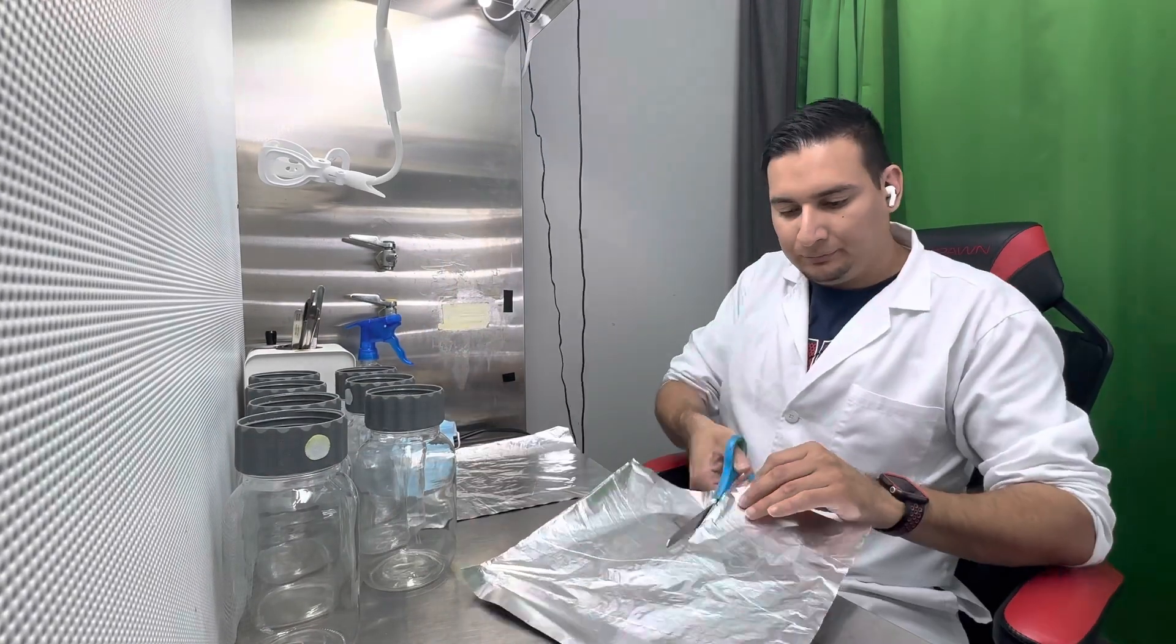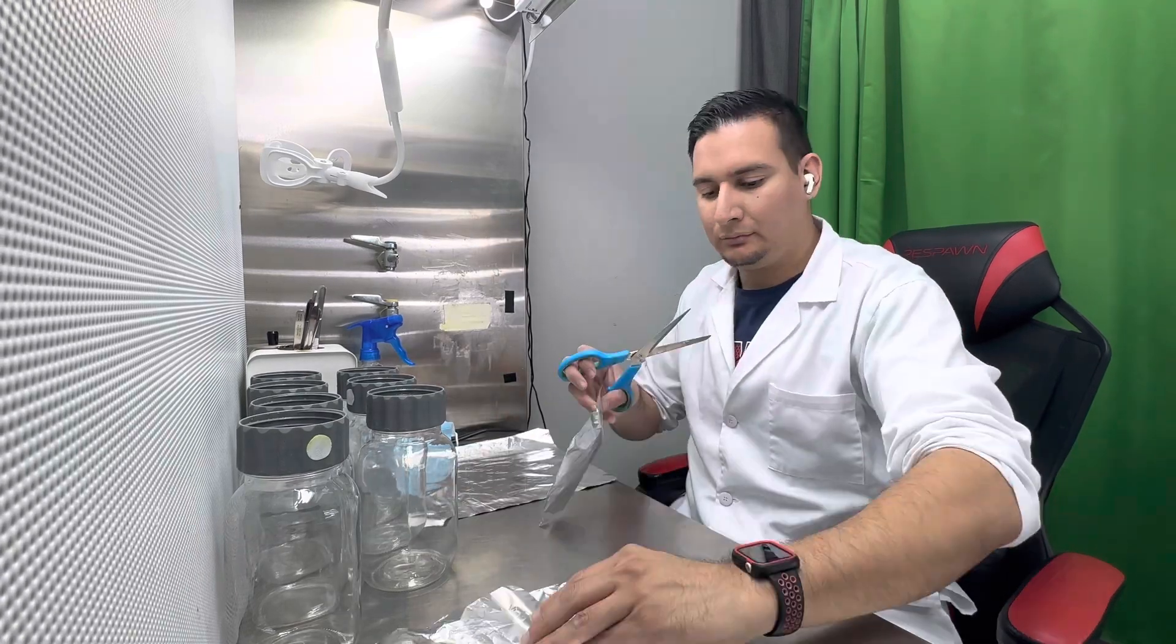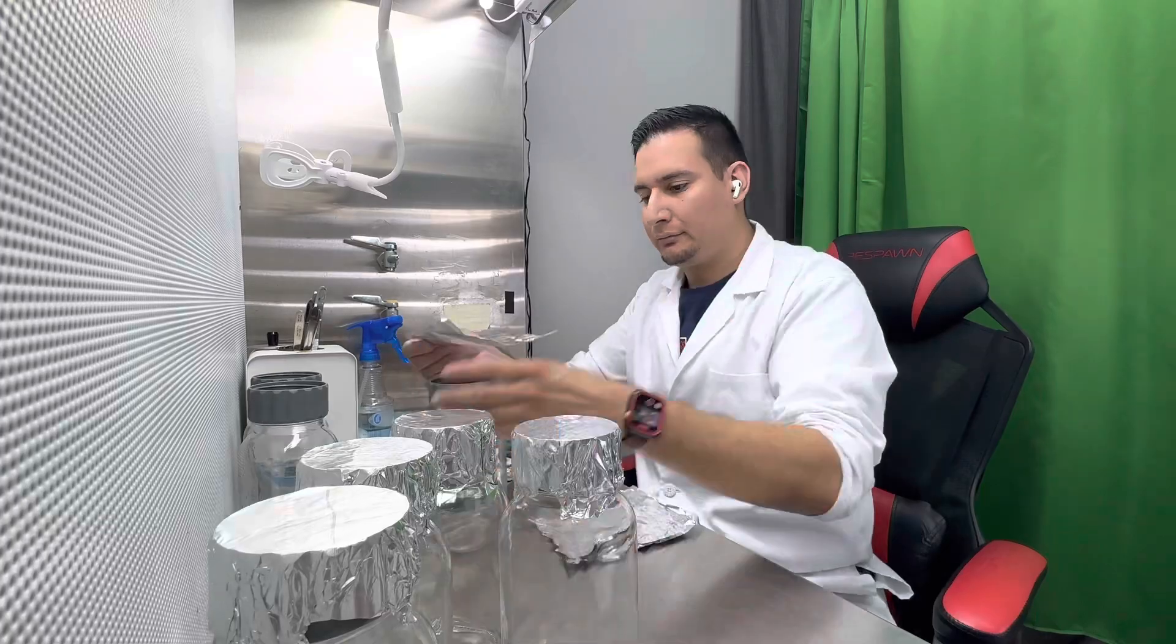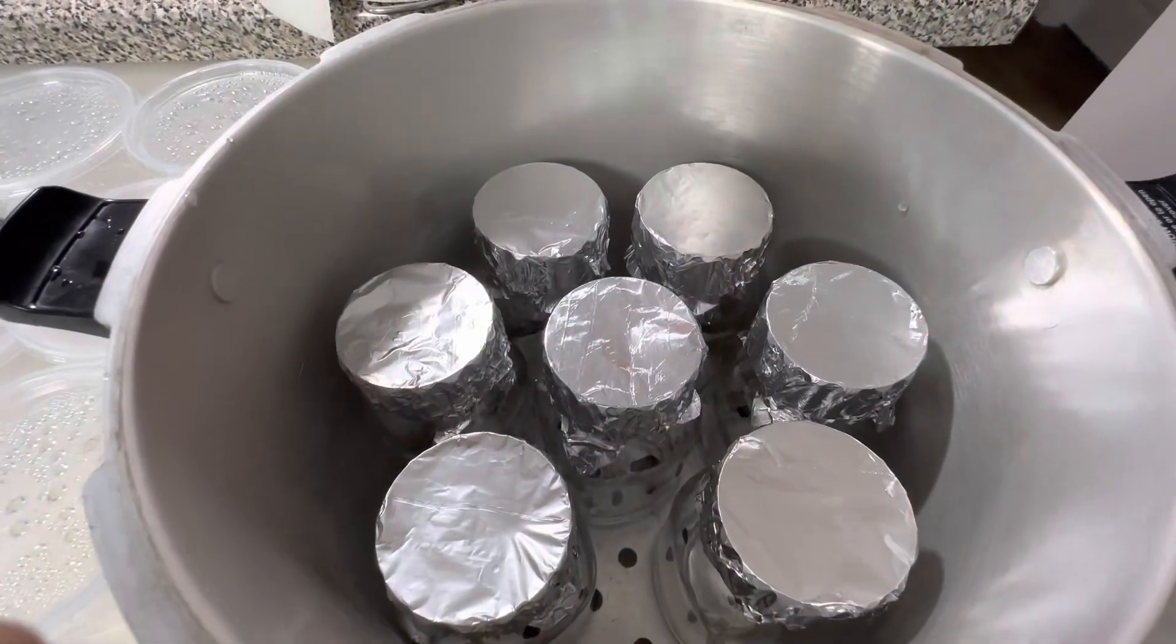But first I need to sterilize the biocouplers, so I place a piece of aluminum foil on top of the cap of the biocouplers and then sterilize the jars in the pressure cooker.